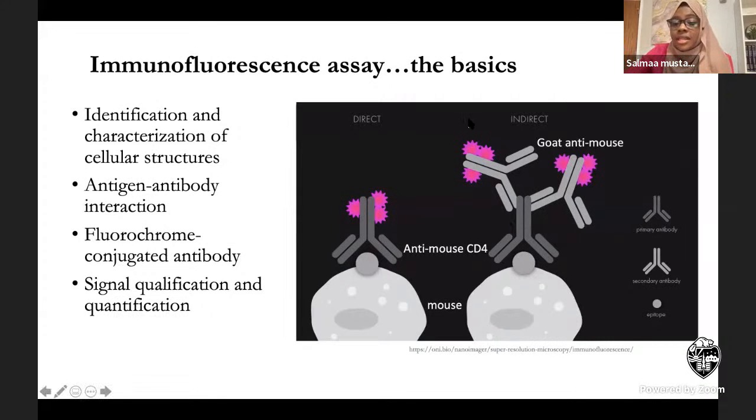Even if you don't have the fancy microscope, because we've done it before, right, Dr. Omar, where we didn't have that kiosk, another thing you can use to quantify your signal is ImageJ. I think it's widely available. Once you get your images, you can put them in ImageJ and use that to quantify how dark or how intense your signals are, and put that in a statistical table or graph. The same way we used the clicker, that machine to count the cells before.